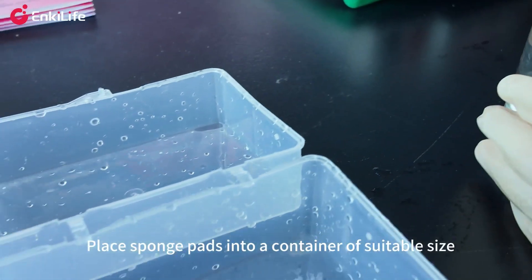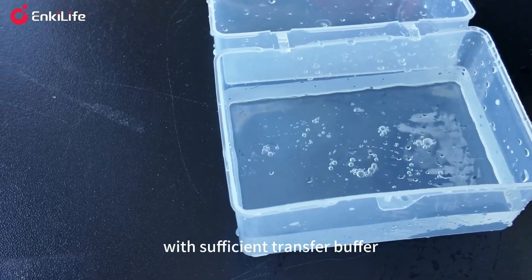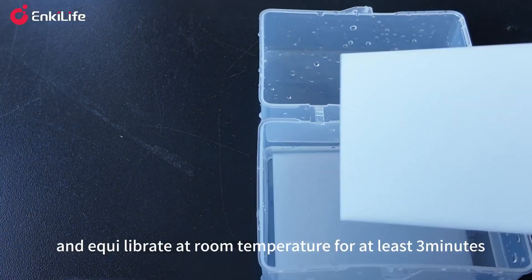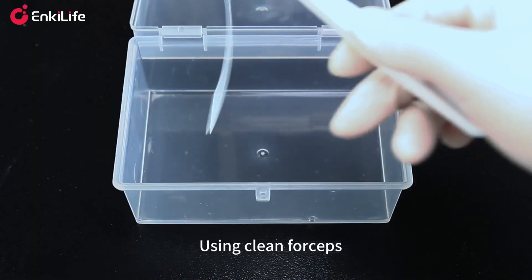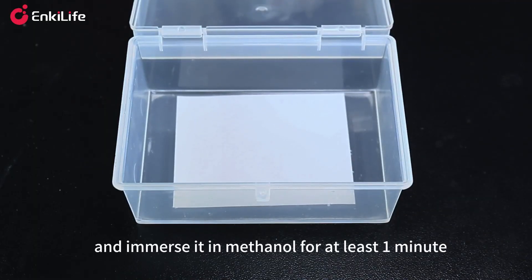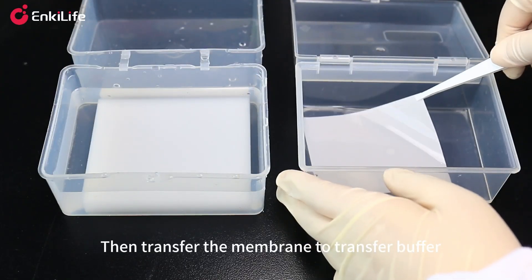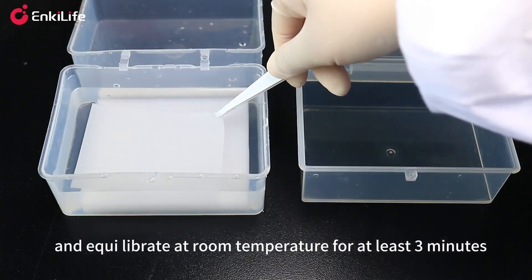Place sponge pads into a container of suitable size with sufficient transfer buffer and equilibrate at room temperature for at least three minutes. Using clean forceps, gently grasp the edge of the PVDF membrane and immerse it in methanol for at least one minute, then transfer the membrane to transfer buffer and equilibrate at room temperature for at least three minutes.